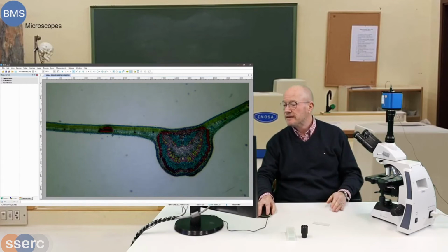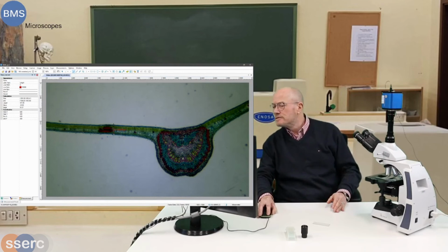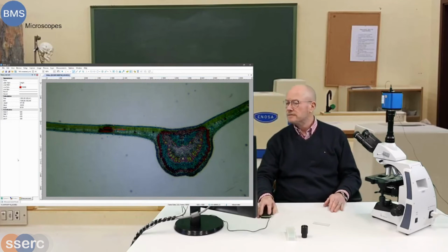Let's do it again. I start here, go all the way up. Wait, I have to do this again. I lost it here. I just delete this measurement and do it again. Start from approximately here up to, that's it. What have we measured there?